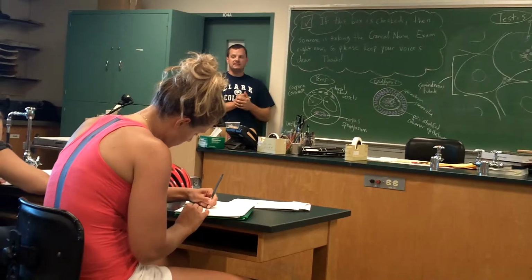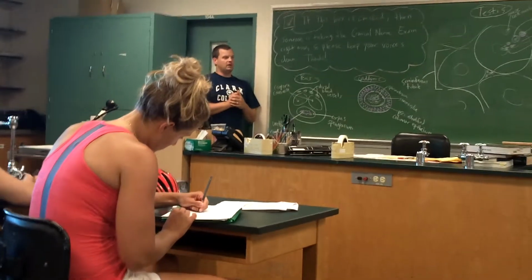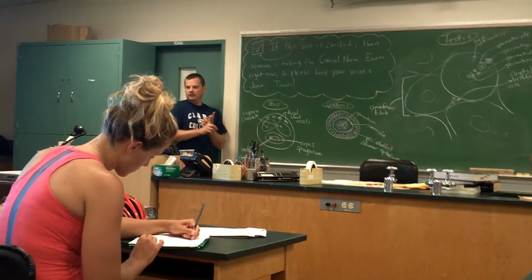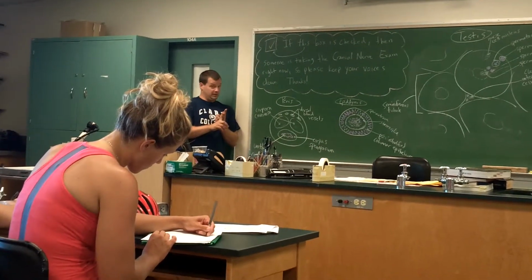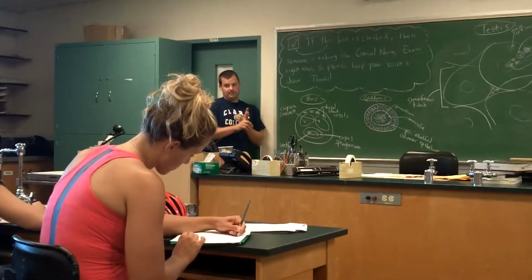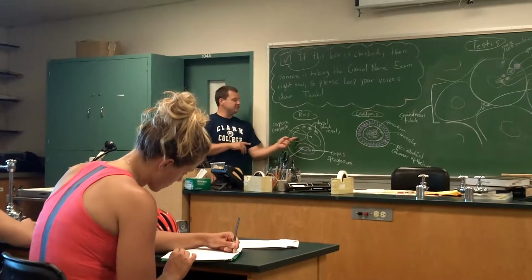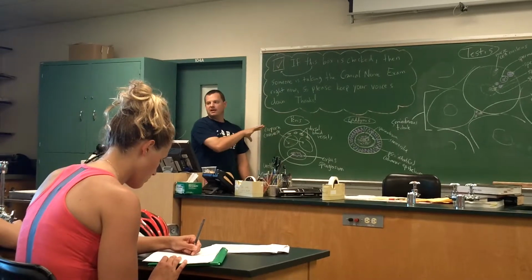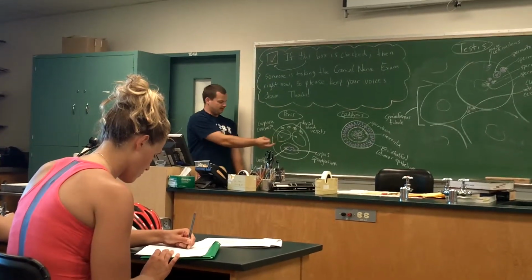Now, some of our penis slides are from either a monkey or an immature fetal human. And if you're a monkey or an immature fetal human penis, you don't actually have two separate corpora cavernosa, you have kind of one. So keep that in mind as you look at the slide. This would be like an adult human.